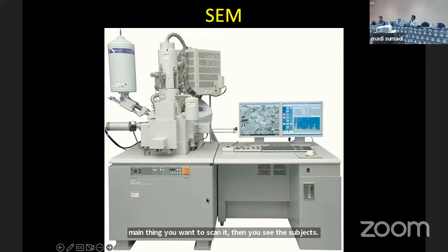The question comes, what is the importance? Why do I need to see the surface, right? I think in the last 15 years there has been very good technical development in understanding the surface, not only in science but in all fields. At the moment, scanning electron microscopy is very popular. Everybody is working with it because you want to see how the surface works. Any kind of designing, any new product you launch, where you want to see how the structure is, they do scanning electron microscopy. Transmission works mostly in science, but the SEM works in all industry, because you want the surface.